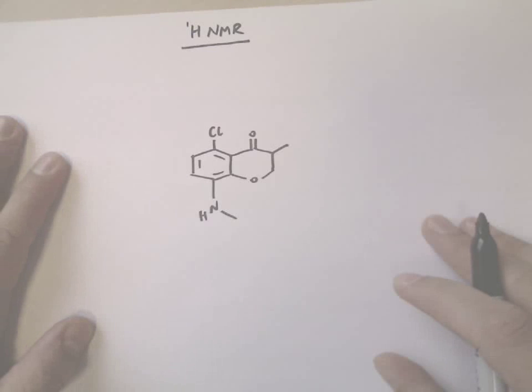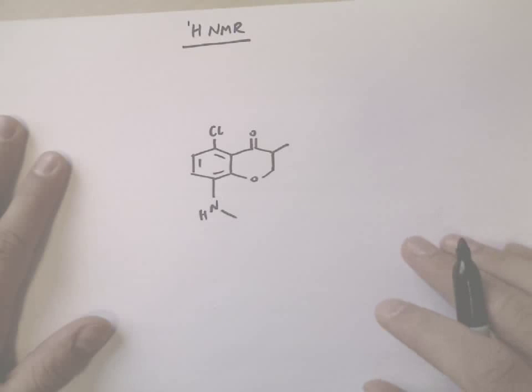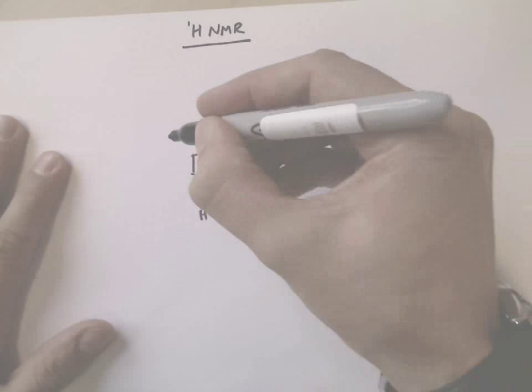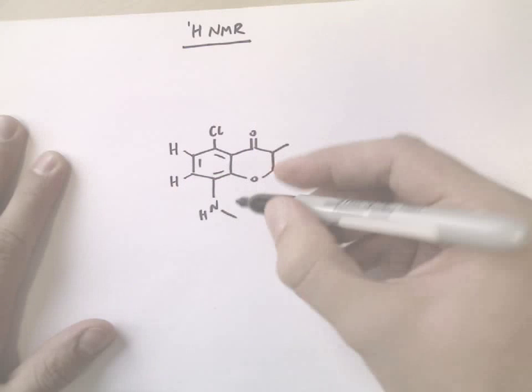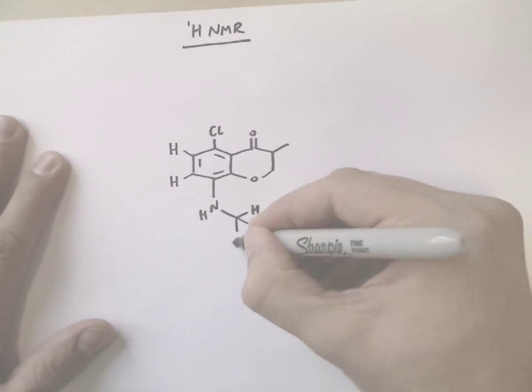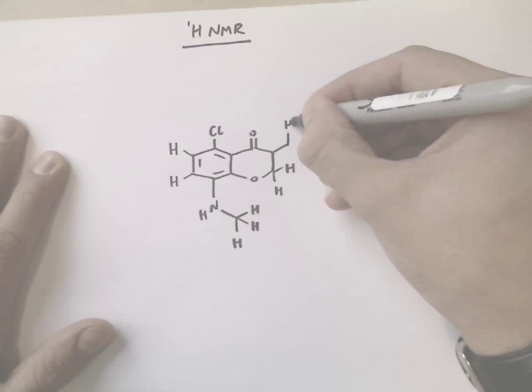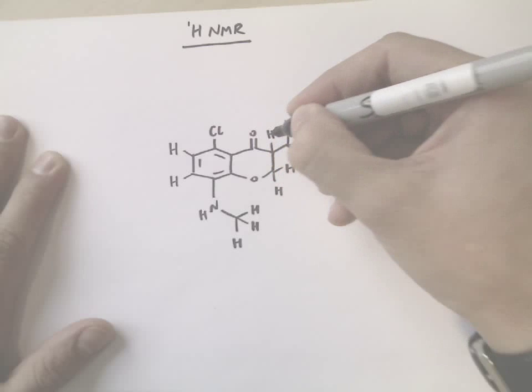And if you remember from the rules we discussed in lectures, the first thing you need to do is to redraw the molecule. So pretend I've done that now, but include all of the hydrogens on there. So if we go around the molecule, adding hydrogens wherever they have not been explicitly drawn. And remember from what we did last year, carbon can only have 4 bonds, so wherever it doesn't have 4, you make it up to 4 with hydrogen.